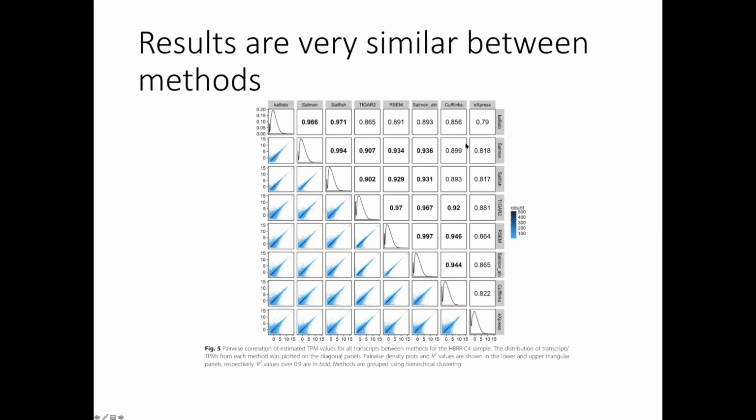So even if I had been using eXpress, and I found some things that I think are relevant, and I've used statistical tests to see that they are, and I found that they are conserved in other species, and it all makes sense, I wouldn't throw those results away. I would still use them, because it's a good result there as well, even though if I had chosen now, I wouldn't have started with that one.